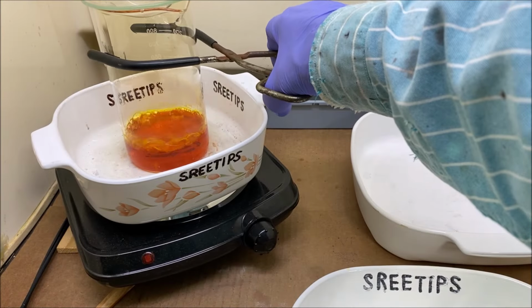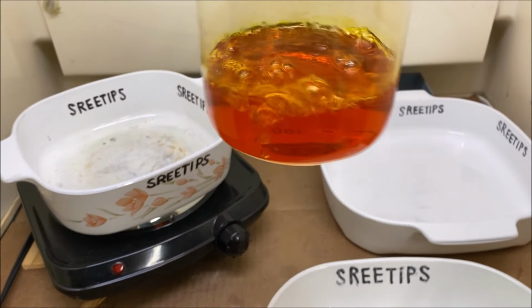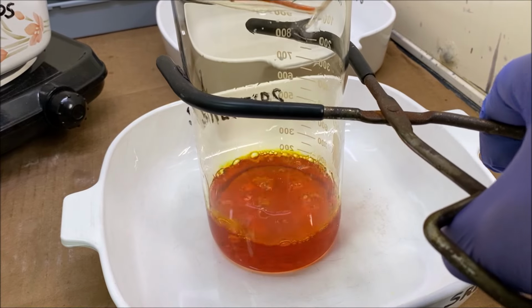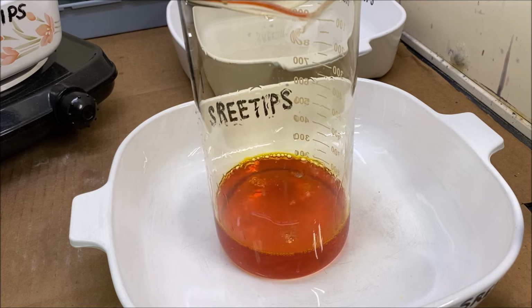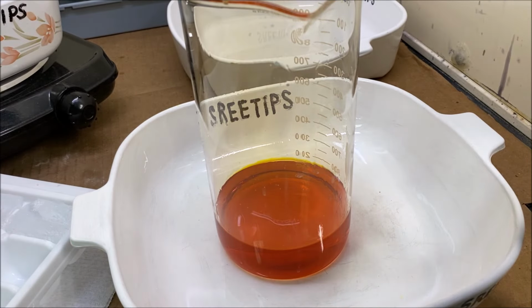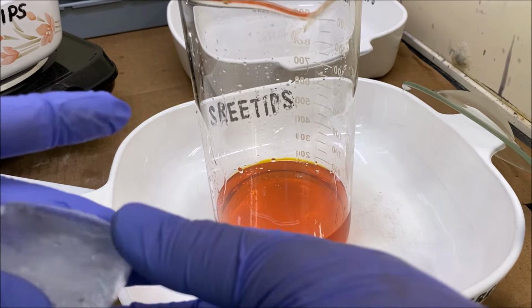Got all the gold to go in solution. It's looking pretty good just for a single recovery with inquartation and parting with nitric. Nice and clear. We'll just let this cool off for a minute. Let's add a little bit of ice here. Get this cooled off so that we can filter it.